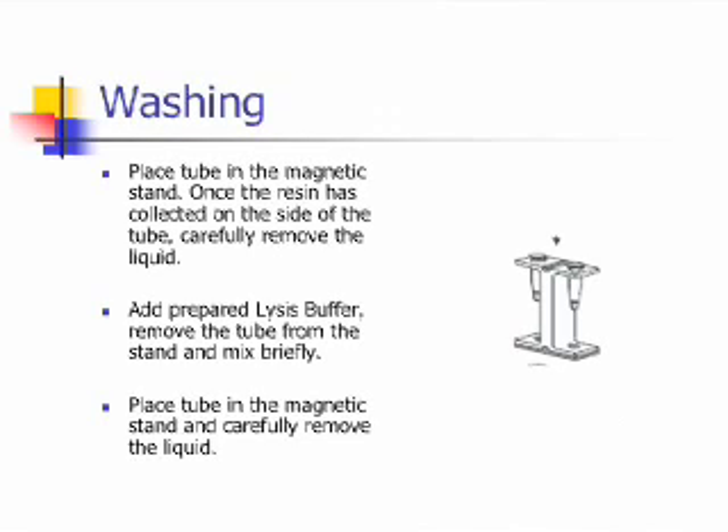The next step is the washing step, which has two parts. In the first part, a lysis buffer is used. Place the tube in the magnetic stand. Once the resin has collected on the side of the tube, carefully remove the liquid. Then add prepared lysis buffer, remove the tube from the stand and mix briefly. Place the tube in the magnetic stand and carefully remove the liquid.